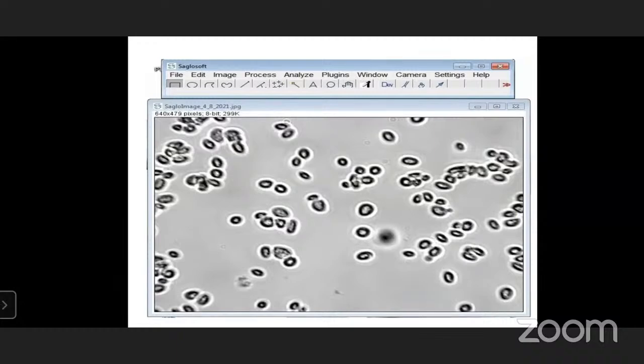Within the 30 seconds you convert this 1 hour or 2 hours videography to 30 seconds and then fast play, you can see what type of divisions the cells have undergone. Okay, we put recording timeline up to the 24 hours.